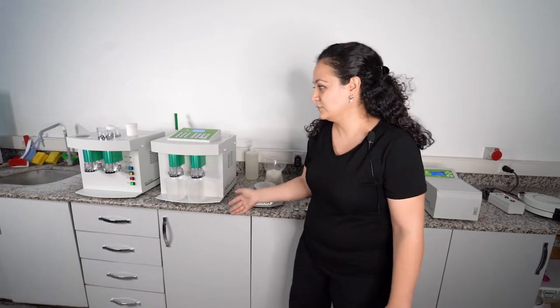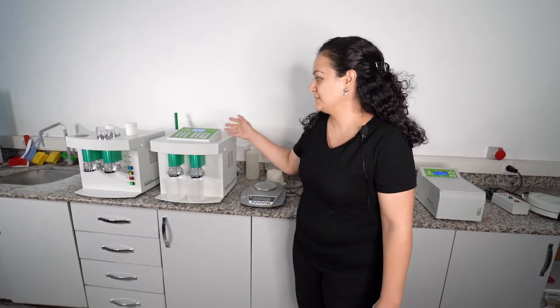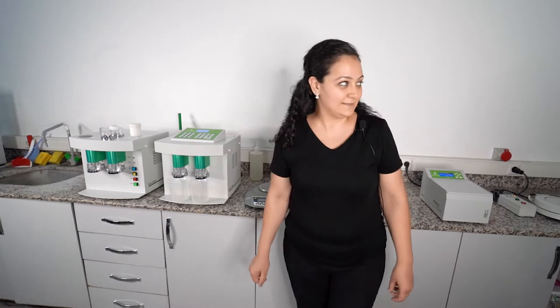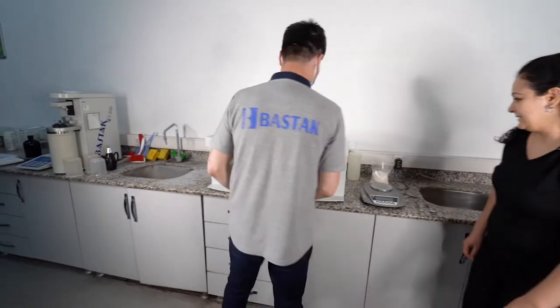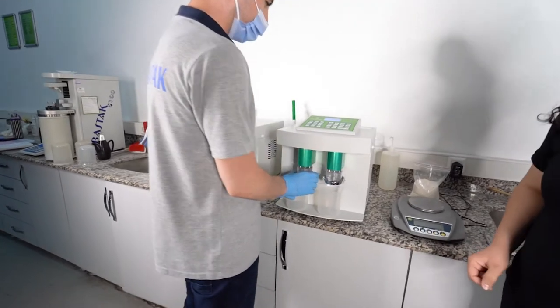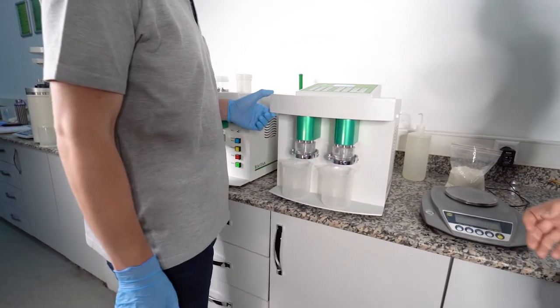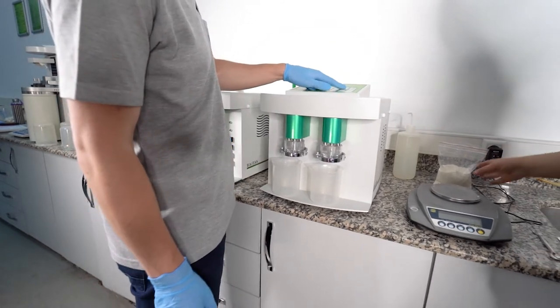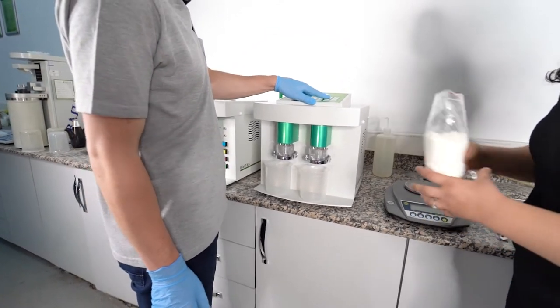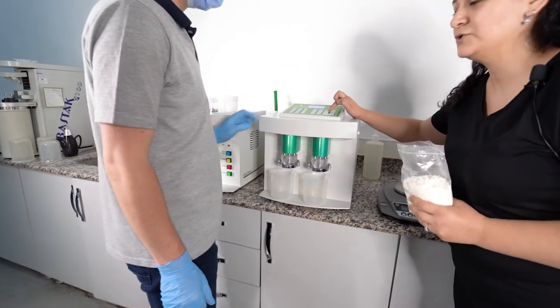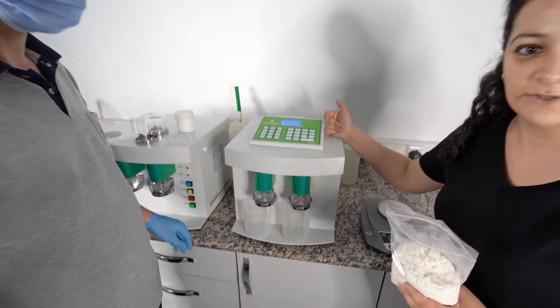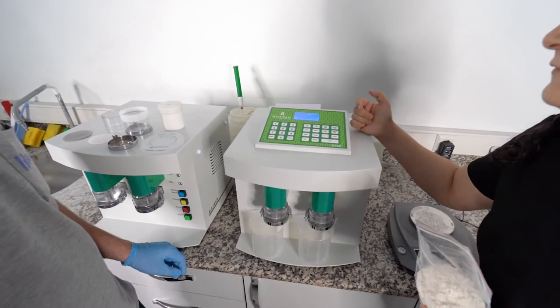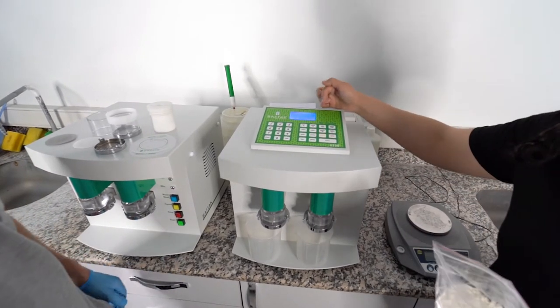We can do the test together and I will show the differences of our products. Moisture is an important parameter today. We know our moisture of flour and we will enter moisture gr button in order to learn how many grams we will use as sample. If our moisture is 14, we will use 10 grams.